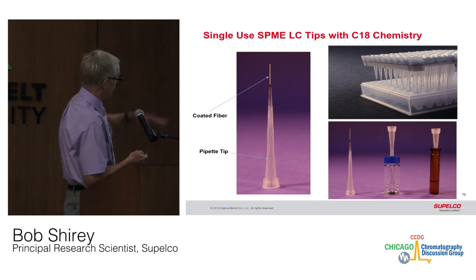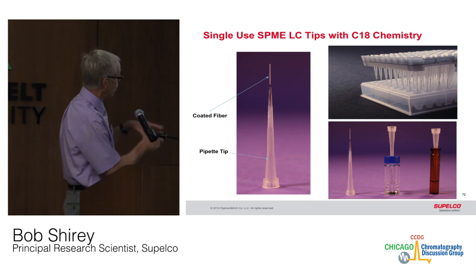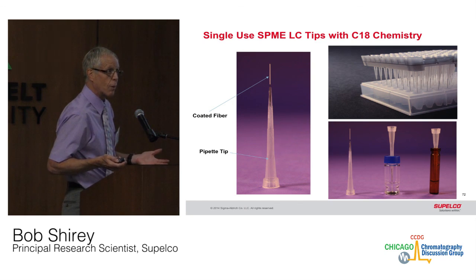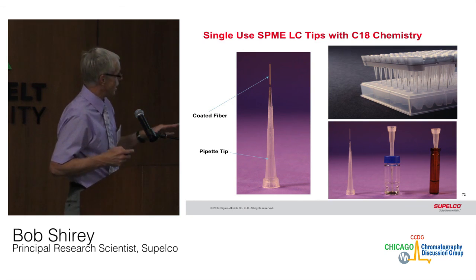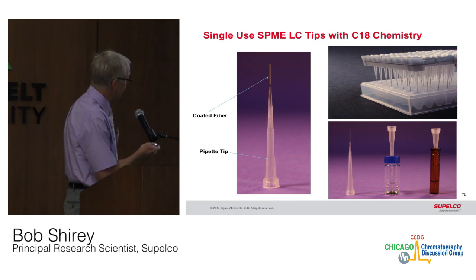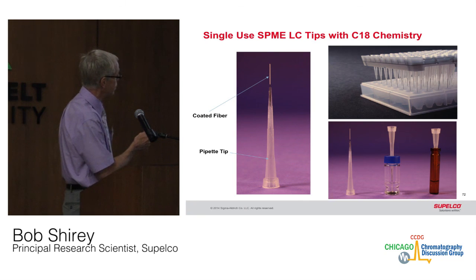extractions. You would then pick up the tray and carry it over to another tray containing solvent, put the fibers into the tray, and then solvent desorb them. Then again, the tray can be put into an HPLC autosampler and the samples run. So it's a fast way of doing multiple extractions, and it should be, in the long run, fairly cost effective.